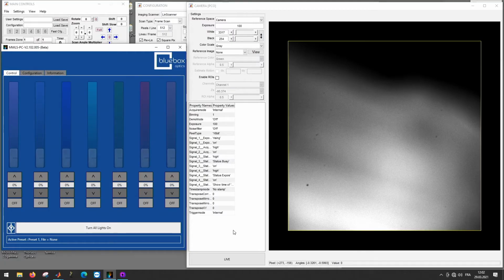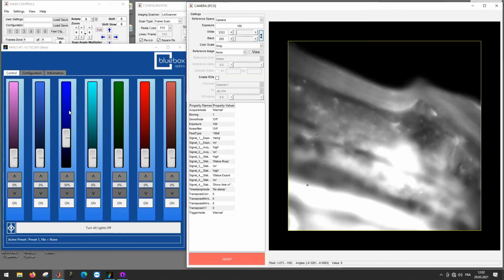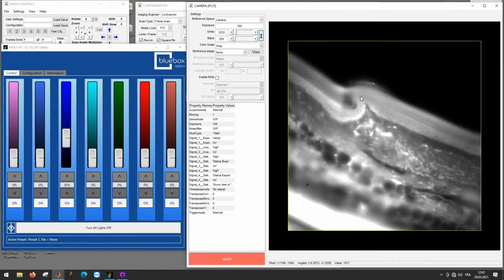Okay, now we can start with our single photon imaging. I start the live mode. I turn on the light and use the blue channel to find the focus, because blue is very convenient for most tissues, so you can find the focus very easily. And here we already are. For today's presentation, we have a sample. It's an unstained cryosection of a mouse tail, which I just mounted in an antifade medium. So we can have a look at the autofluorescence only.